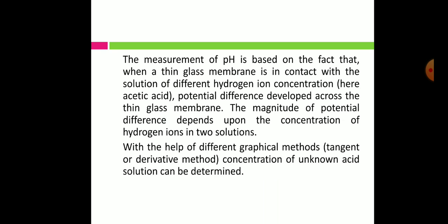of the hydrogen ions. Now the reference electrode which we are using here has a constant potential, and its value is 0.24 volts. So it is constant. So the potential of the cell depends entirely on the potential difference which is developed across this glass membrane and which depends upon the hydrogen ion concentration outside the glass membrane, that is in the test solution.